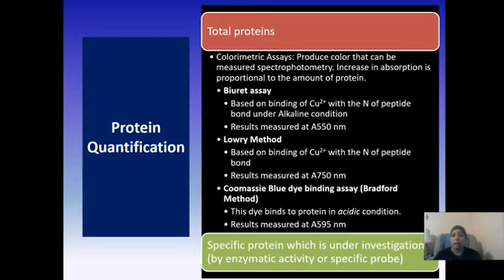So sometimes you may not get a beautiful, simple linear curve to look at. You may have to actually do a logarithmic or polynomial equation instead. However, again, the biggest advantage of this is that it's very quick. You can get those numbers very quick. One disadvantage of this method is that, because it is so quick, you can run out of the linear range and saturate.